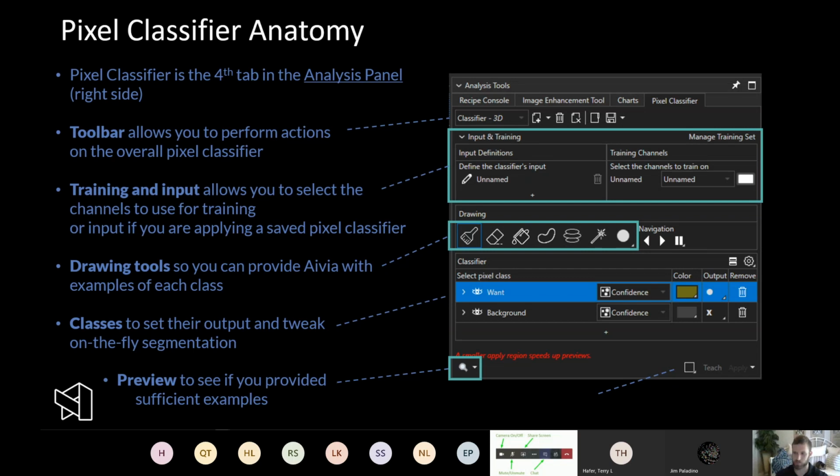The images we're working on today, it's actually not going to matter much. This is all done on the GPU, and on 2D images, like one of the ones we're going to look at, it's fast no matter what. It's imperceptible, the difference. So today we're going to mess with the slider a little bit, and you'll see there's not too big of a change.